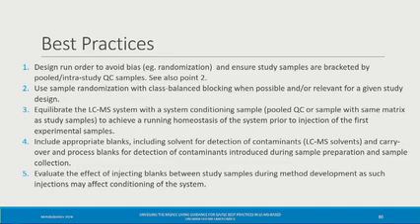I think that's where this is coming from. And I can't remember where the original data set where I saw this came from off the top of my head. Just want to point out your example is comparing block versus not randomizing at all. Of course, if you run A together, B together, that's no randomization at all.